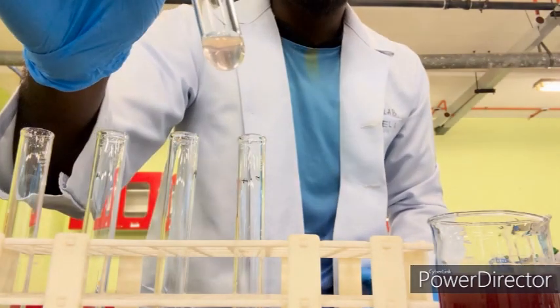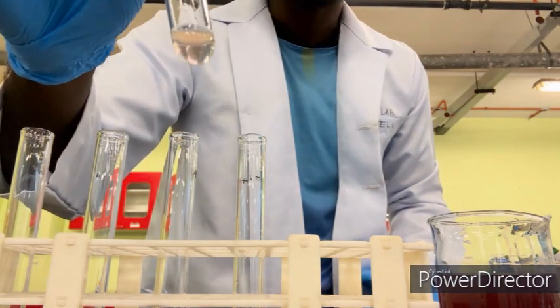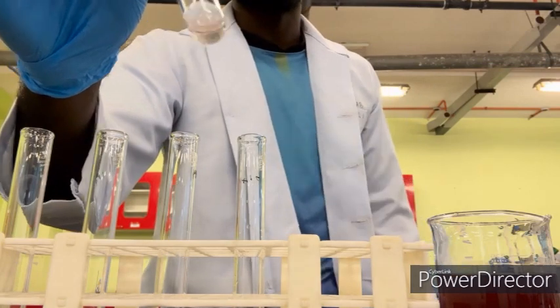These are the reactions once we add our onion peel extraction into our distilled water.